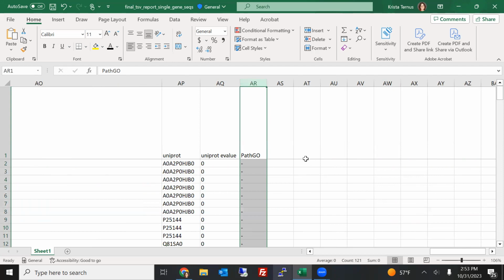And I like this because pathgo is an abbreviation for pathogenesis gene ontology. It is an ontology that was developed by Johns Hopkins University Applied Physics Laboratory under the IARPA GCAP program. And Gene Godbold and others from our biocuration team collaborated with the pathgo developers to help review and refine this ontology.